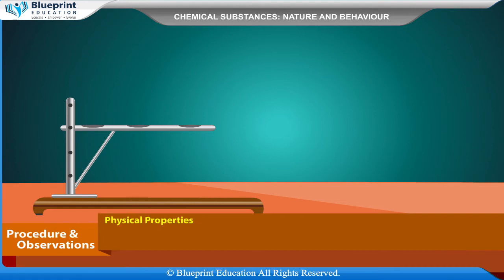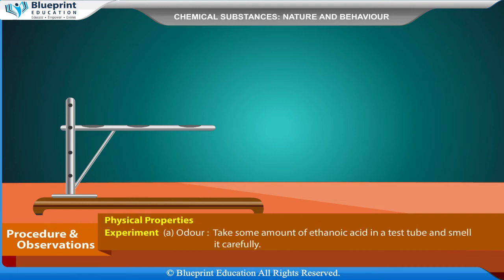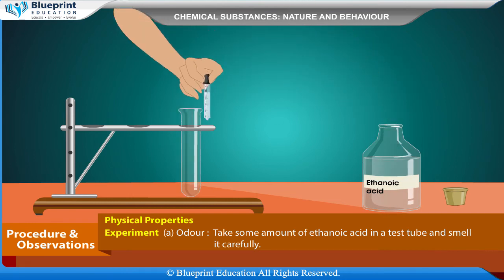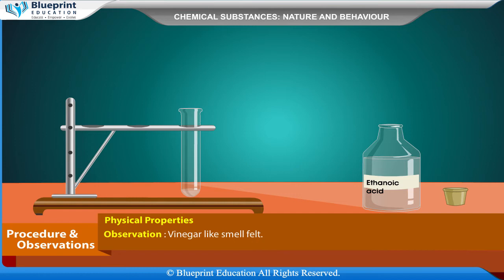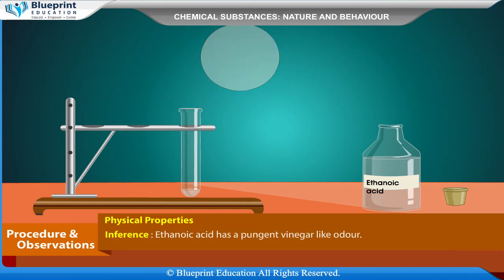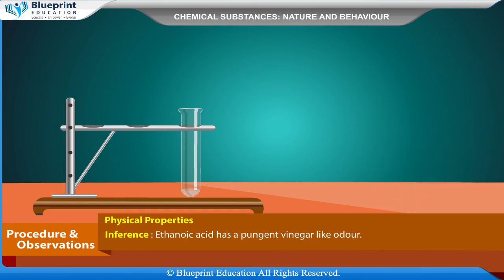Physical Properties — Experiment: Odour. Take some amount of ethanoic acid in a test tube and smell it carefully. Observation: Vinegar-like smell felt. Inference: Ethanoic acid has a pungent, vinegar-like odour.